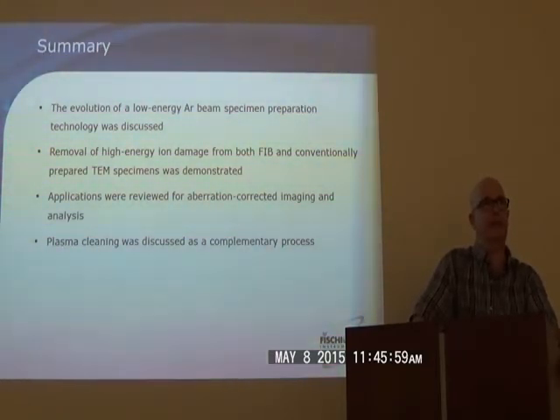So it'll be at 15 kV. You probably can't do a whole lot with it because you'll go right through it, even at 13 or 12 kV. 7 is probably the target. So 10 is probably a good compromise for resolution and also being able to monitor the thickness. Just doing a calculation in my head, 30 kV, you historically could get through about 500 nanometers. That's what I recall for silicon. So even 15 kV, you could blow through like 250 nanometers, I think, which is way thicker than most of even our specimens that we start with. So yeah, that's a little bit too much.